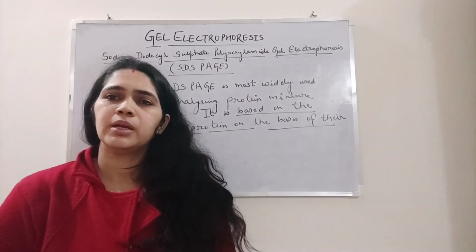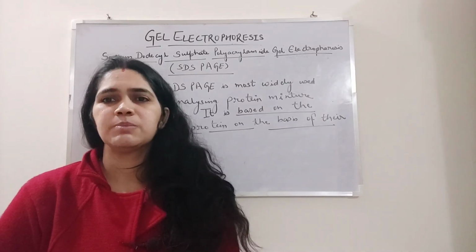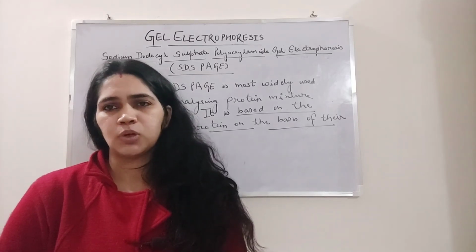जिस मिक्सचर को हमें या प्रोटीन के जिस सैंपल को हमें रन करना है पेज पर, उसको हम सबसे पहले बॉईल करेंगे 5 मिनट्स तक एक बफर सॉल्यूशन के अंदर, जिसमें आपका SDS और बीटा मरकैप्टोइथेनॉल होता है.